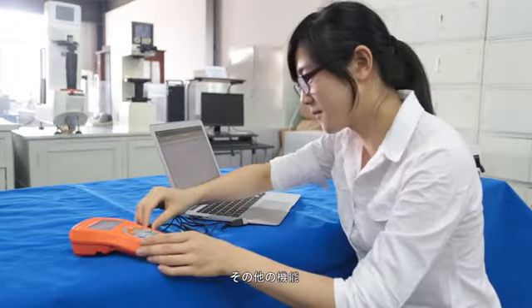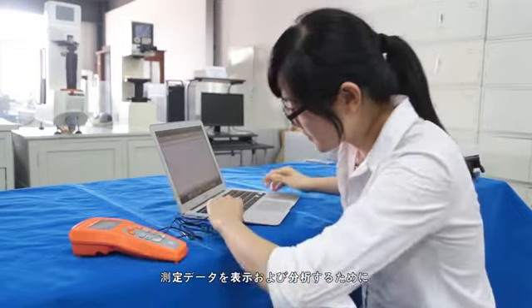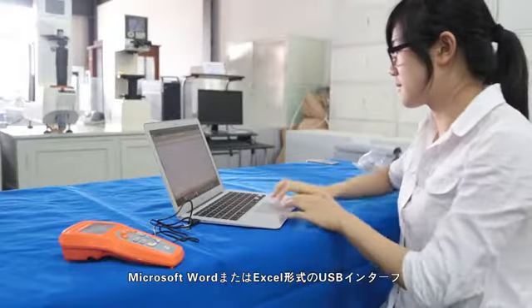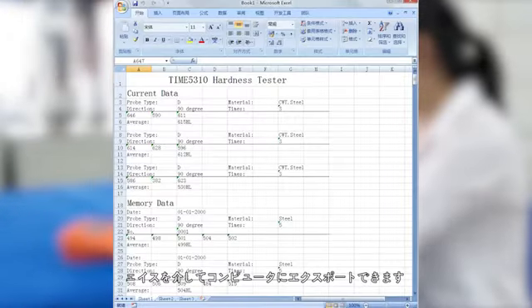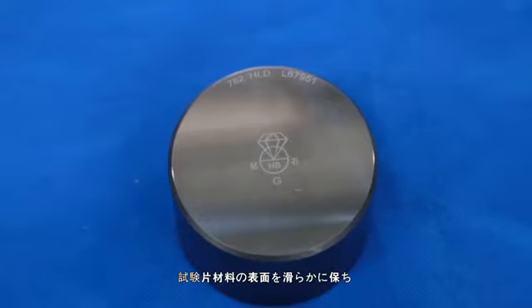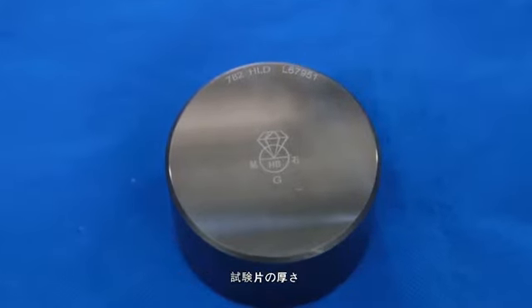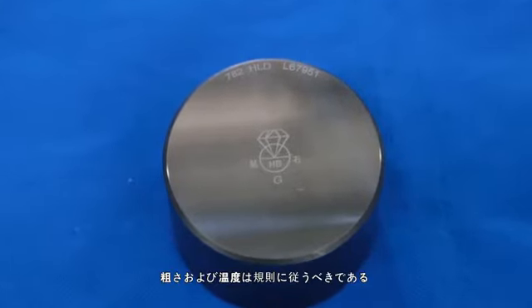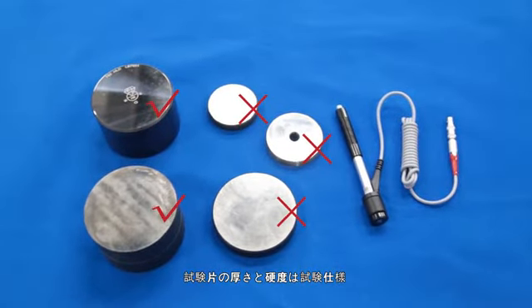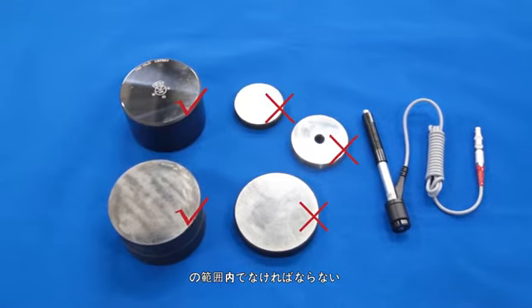Other functions. Data can be exported by USB connector to Microsoft Word or Excel for review and further measurement analysis. Useful tips for testing. The surface of the testing sample should be leveled, flat and smooth, clean and dry. The thickness and hardness of the testing sample should be within the requirements stipulated in the instructions.